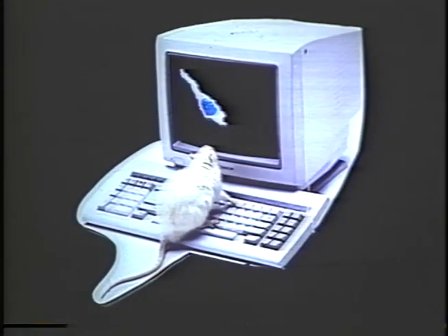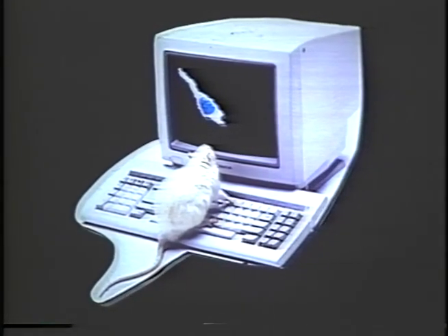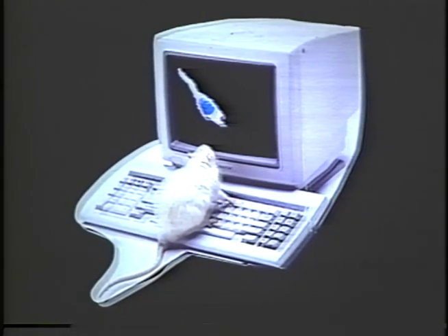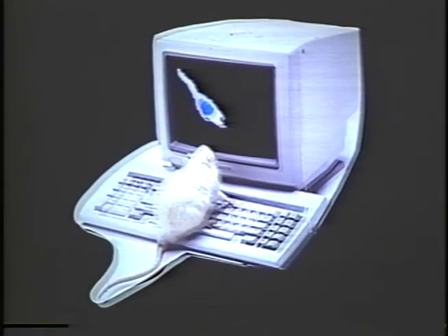So one approach that we use is an IBM PC-based system for producing three-dimensional reconstructions from micrographs of serial sections. The software for this was written by my colleague, Dr. Stephen Young, who was at the University of California at San Diego.